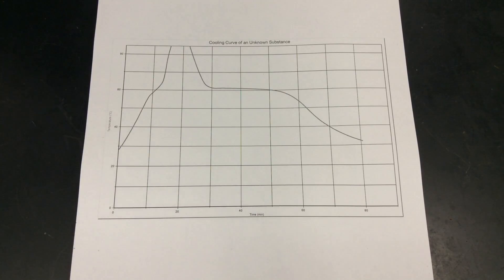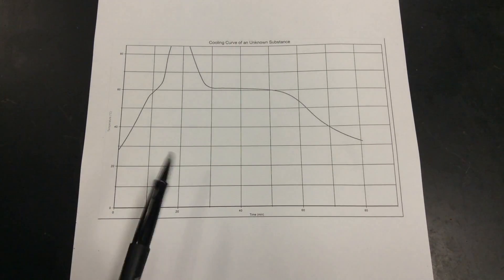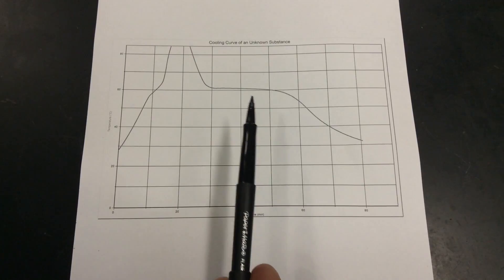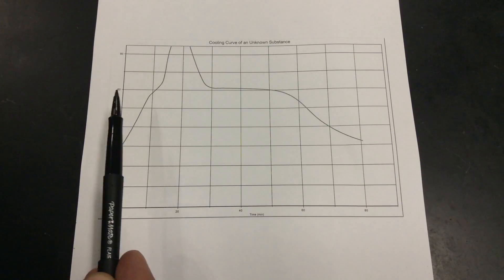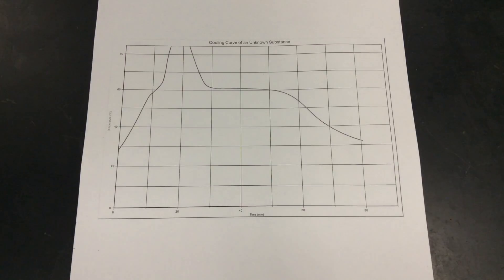Now that you've done that, to confirm what your estimated melting point is, and remember, I want you to draw a straight edge line from where your most flattest position over to the Y and try to guess what you think your value is. The best way to do this is look at our data table.